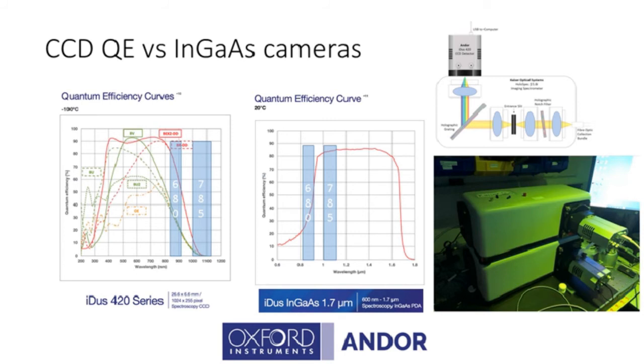So what we did to enable us to look at blue stained tissue, with 785 light, which doesn't induce the fluorescence, is we've had to move to an InGaAs camera, which is also available in a similar configuration. And you can see on the plot on the right, we've got a much higher sensitivity to the 785 nanometer light.